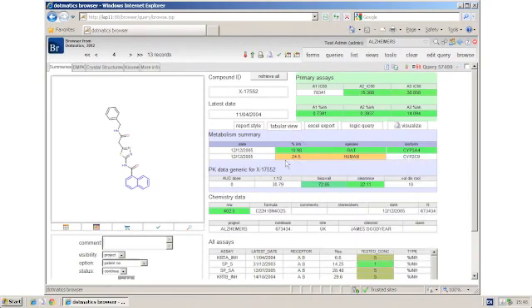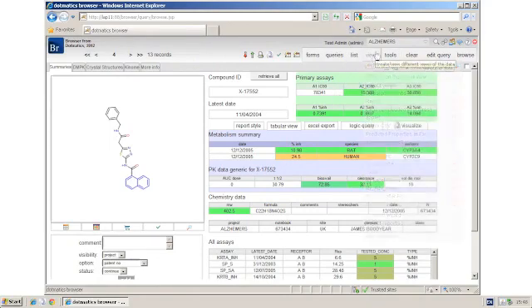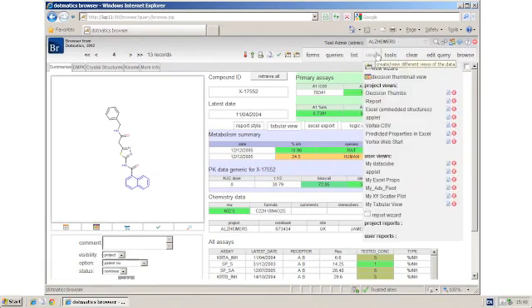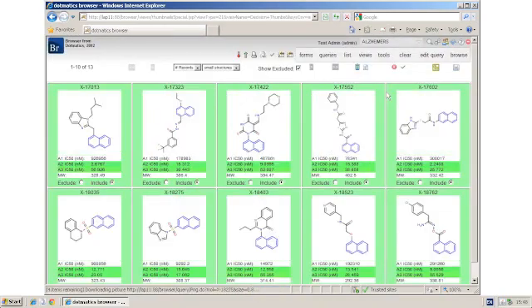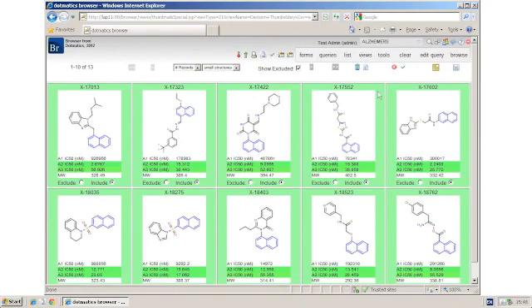I can also change the different views. I have some views saved on my views menu. I may want to see a decision thumbnail view, which here has data and structures together, and I may want to exclude some compounds from that list.